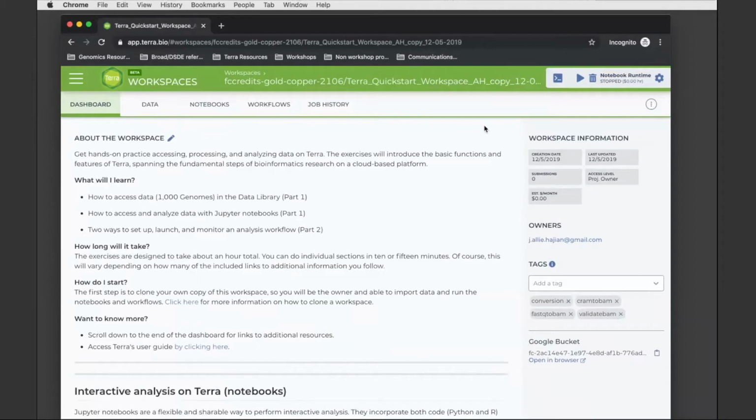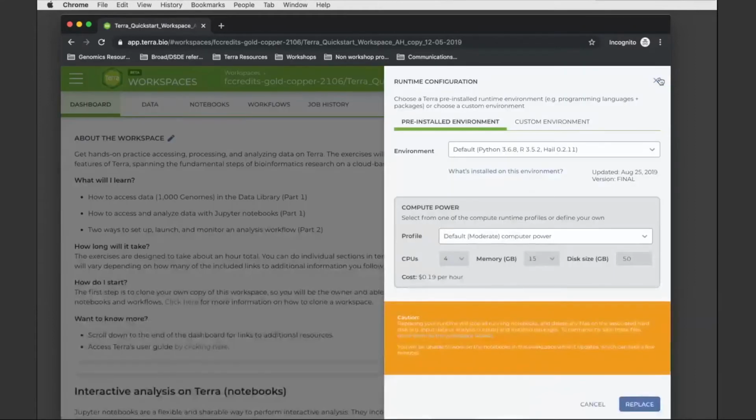So at the top right, there is this interesting feature that is actually related to the notebooks that I'm going to have you, if you're working along with me, actually start up. You can go to the little gear icon at the top right, and you can see that notebooks can have a lot of different options.